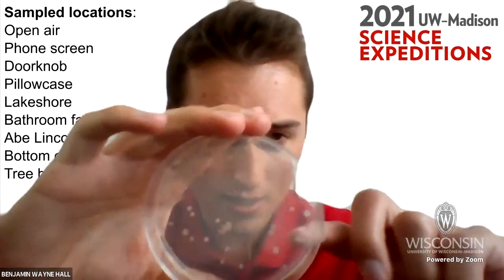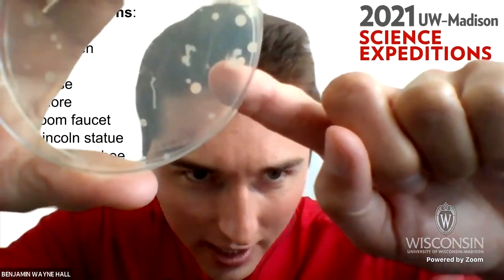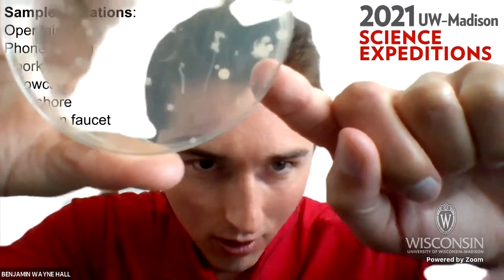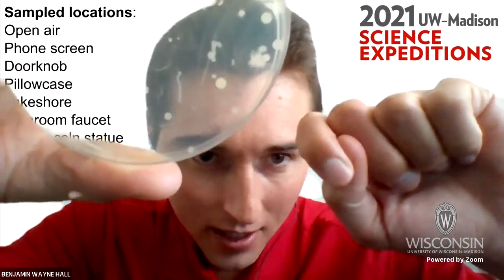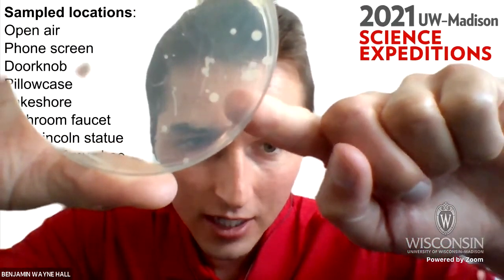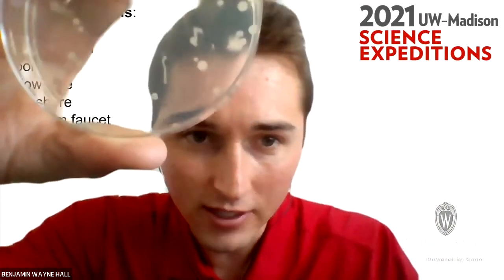So let's see if we can see this on the camera. This one is nice and fuzzy and doesn't really have a clear circle around it. So that tells us that that's probably also a different kind of bacteria than, say, this nice perfect circle over next to it.